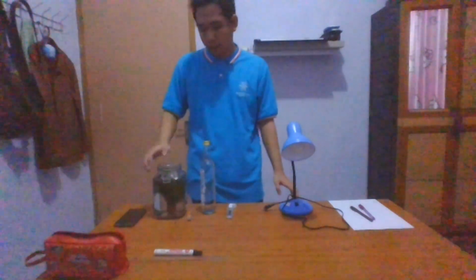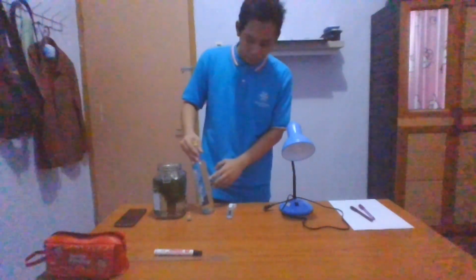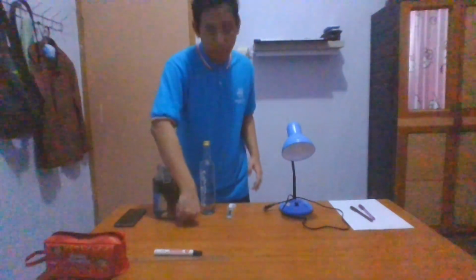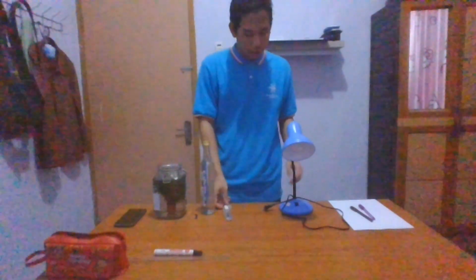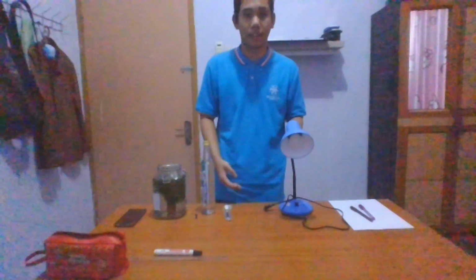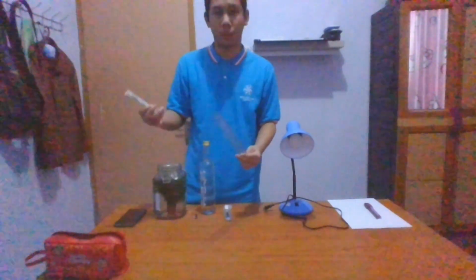Now, I'll be explaining the tools that I'll be using for this experiment. Firstly, we have the Elodea, and then a syrup glass bottle that will be used as the vessel of the Elodea for the experiment, and then a paper clip to weigh down the Elodea, a cutter to cut the Elodea, a table lamp that we will use as the source of light, a pen and paper to record the data. And then we also have a ruler and a spindle.